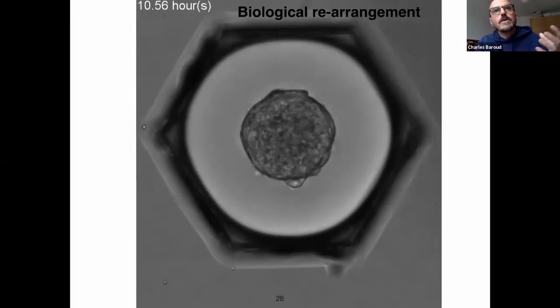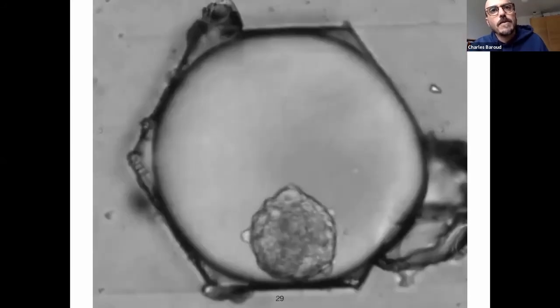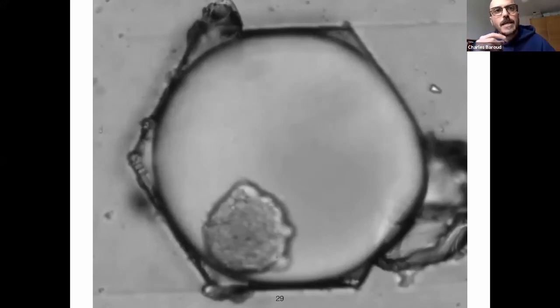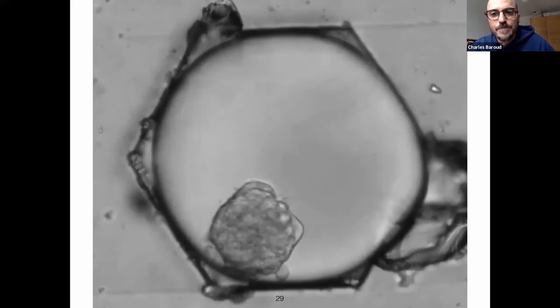And so after a few hours, what you see is this really nice, compact biological object that has not only a bunch of cells inside it, but the cells are actually organized depending on their phenotype, depending on what proteins they express, what stiffness they have, and so on. And you can play more fluid dynamics games by actually applying an external flow here. And you can see that this aggregate is really circular and really spherical.